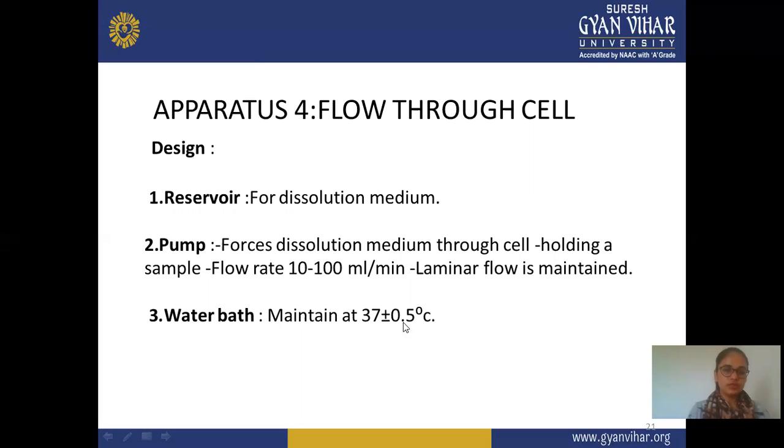This 37 degrees Celsius temperature is common for all types of formulation or all USP apparatus, including type 1 to type 7, because this is the body temperature.